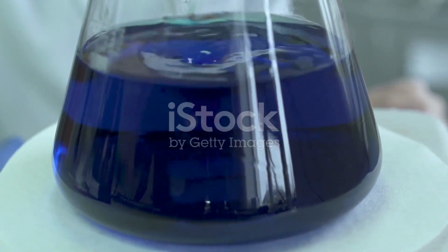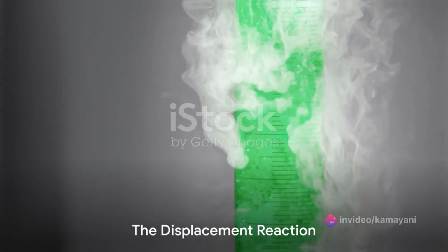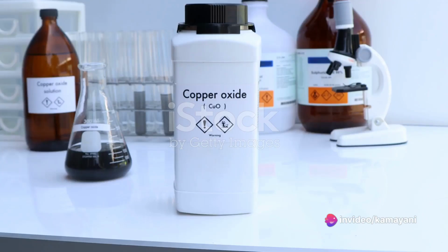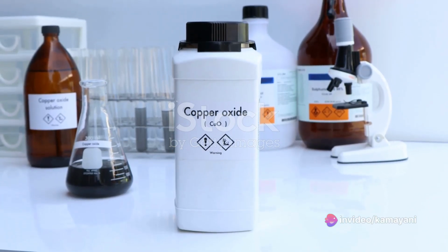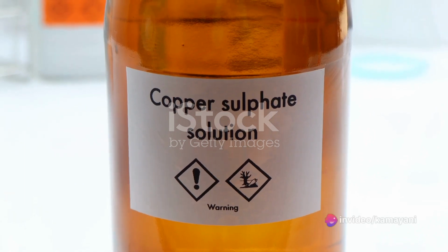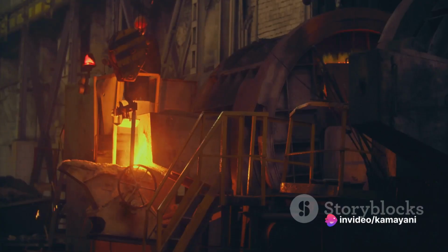But why does this happen? It's all about chemistry. It's about a process known as a displacement reaction. In the world of chemistry, stronger elements displace weaker ones. Iron is a more reactive metal compared to copper. So, when an iron nail is immersed in a copper sulphate solution, iron displaces copper from copper sulphate, forming iron sulphate. The copper displaced from the solution settles on the iron nail, giving it a coppery appearance.